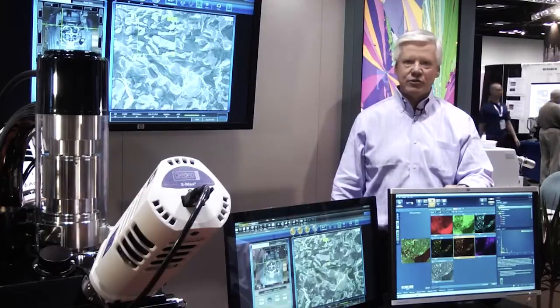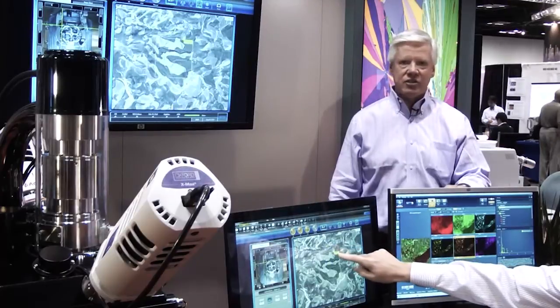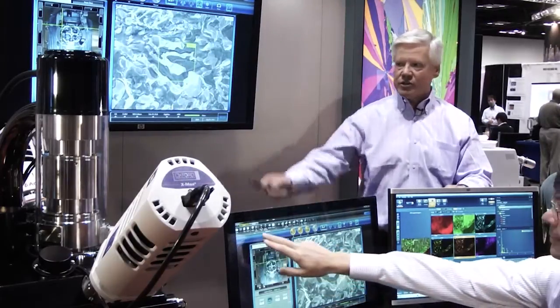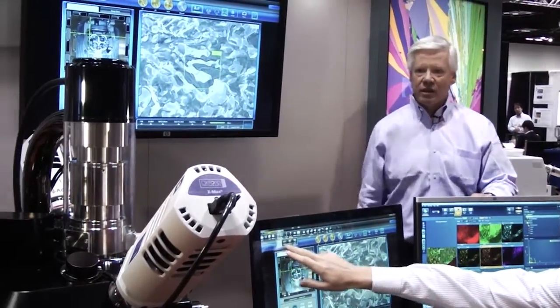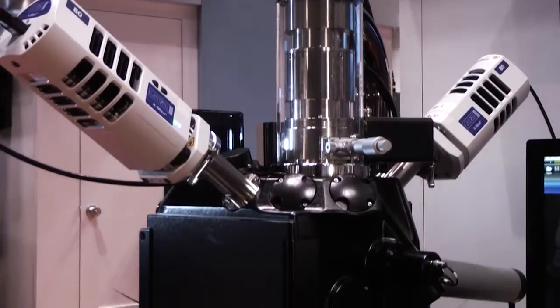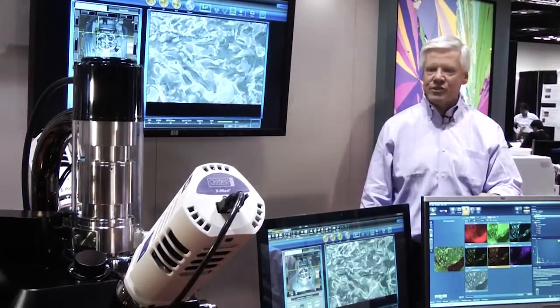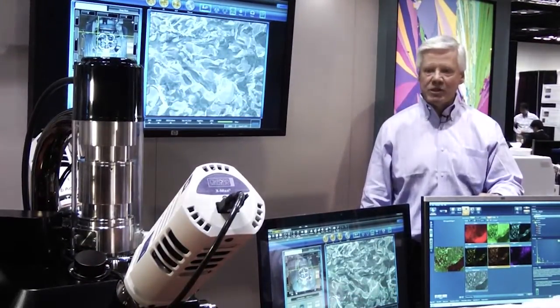JEOL's microscope is fully integrated with all the EDS manufacturers. One of the concerns is being able to collect large data sets very quickly. As you can see from the specimen chamber, the instrument is currently configured with two large-area Oxford EDS spectrometers. We're integrated with all of the manufacturers as I said.